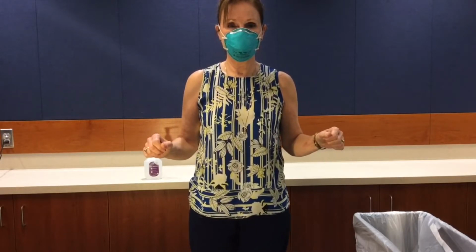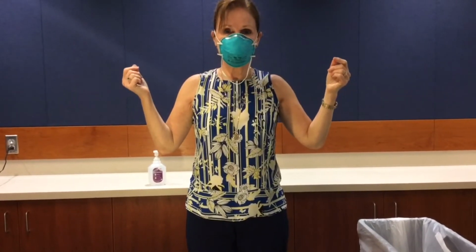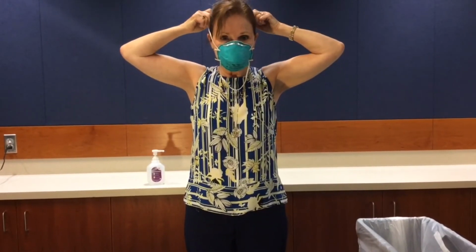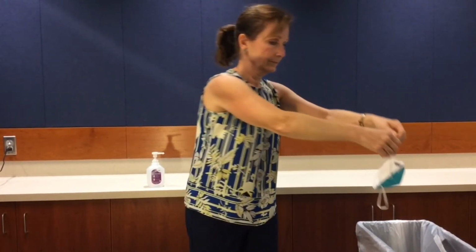The last item of PPE to be removed is your N95 respirator. This is done outside the airborne infection isolation room. Remember that the front of the respirator is contaminated, so never touch the front. To remove your respirator, slowly lift the bottom strap from around your neck and up over your head. Next, lift the top strap off your head and move the respirator in a forward motion away from your face. Discard the respirator in a waste container.